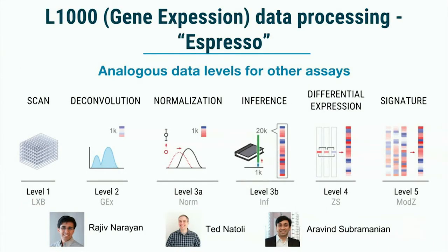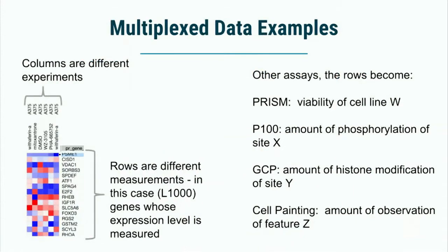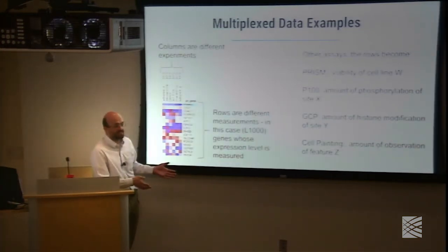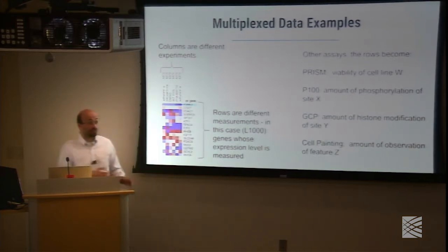Sorry. Sure, please. How is viability a multiplex readout? Well, the reason it's multiplexed is that in a given experimental condition, they'll have a pool of 25 cell lines. They'll have those 25 cell lines all together in a single well, and then they'll measure that. That's how they prepare the lysate, in pools of 25 cell lines. And then after we've prepared the lysate, we can pool that down so we effectively have the lysate from 300 cell lines that have been treated in the same conditions in a single well for detection. Thanks. Good question.